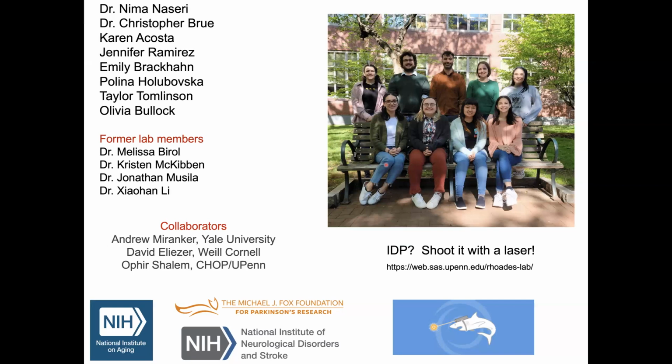One quick technical question, because I'm not too familiar with FCS. When you have the diffusion time on the y-axis with the different constructs that you tested, where does the dispersion on the x-axis come from? On the x-axis, that's just plotting, right? If we plotted all the data at a single point, you would not be able to really see the distribution. So the x-axis is just plotting. Yes, okay, exactly. Wonderful. Thank you.